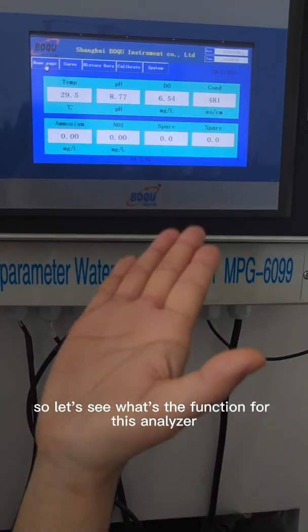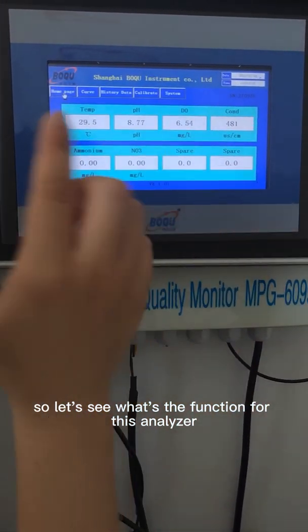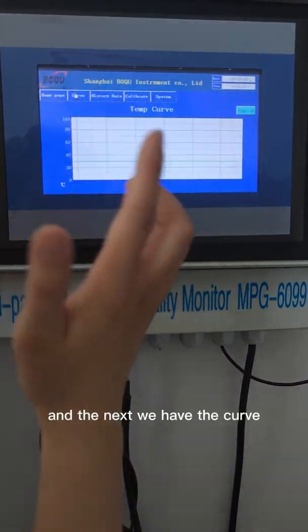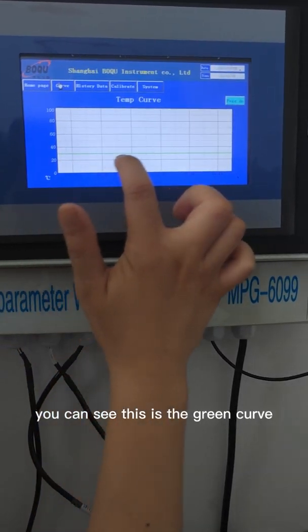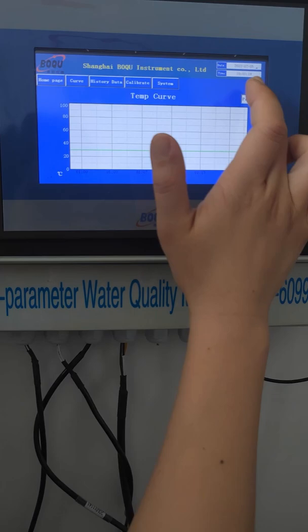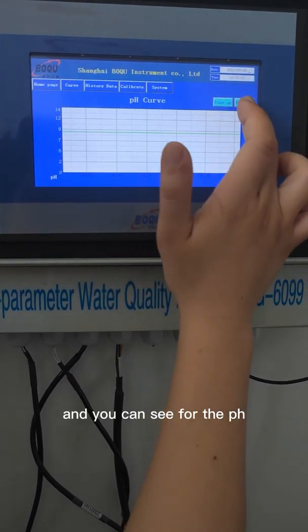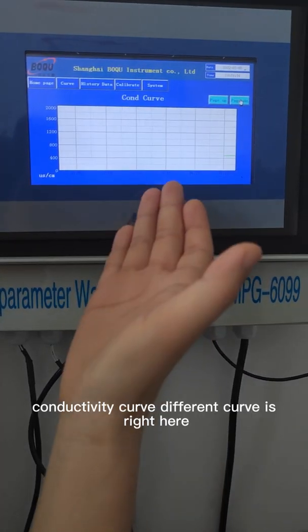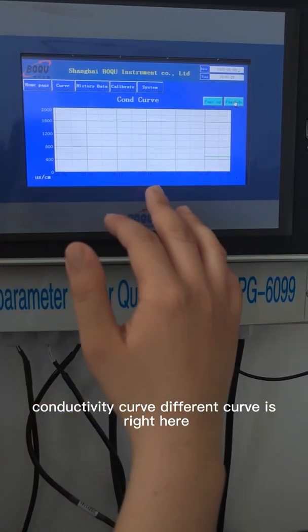Let's see what's the function for this analyzer. This is the home page and next we have the curve. You can see this is a green curve. Right now it is very stable and you can see the pH, dissolved oxygen, and conductivity curves, different curves right here.